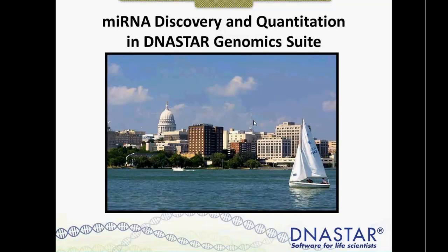So today we're going to be talking about some miRNA tools in the DNASTAR Genomics suite. I've had a number of customers in the past year or two that have miRNA data and really have wide-ranging needs, depending on the workflow and the organism that they're working with. So we thought it would be a great idea to do a webinar that shows you some of the flexibility and the different options in the DNASTAR software packages to work with this type of data.